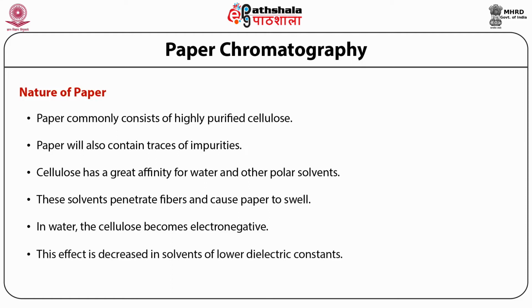This effect is decreased in solvents of lower dielectric constant or with increasing salt concentrations. The paper exhibits weak ion exchange properties as well as adsorptive properties. Furthermore, it is a mild reducing agent and on prolonged contact, it will react with many oxidizing agents.